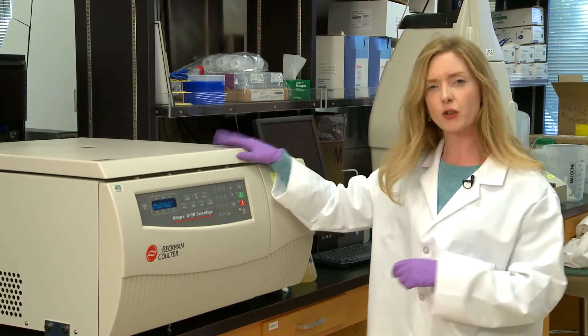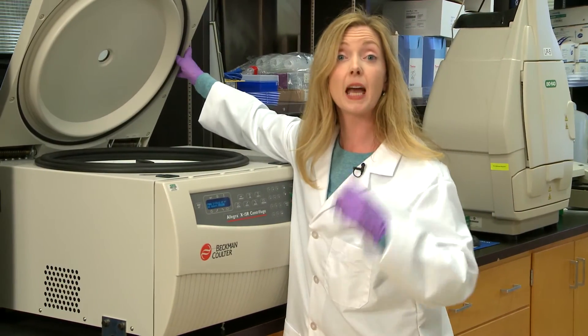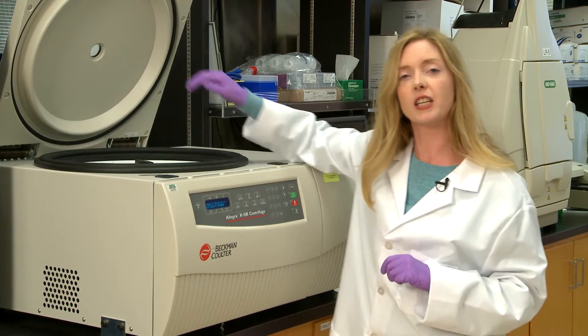First off, you're probably going to want to centrifuge your sample. You can use speeds up to about 45,000 rpm for 30 minutes using a 45 Ti rotor.